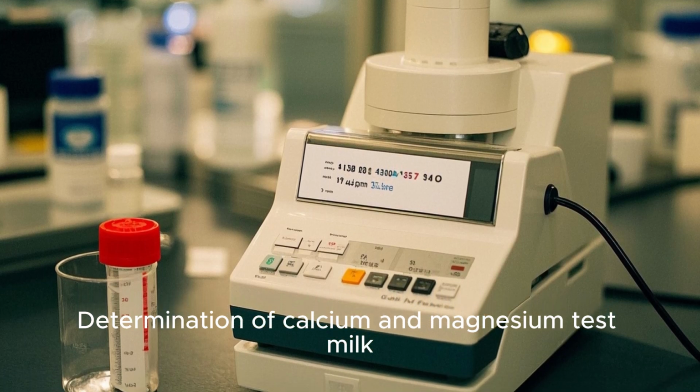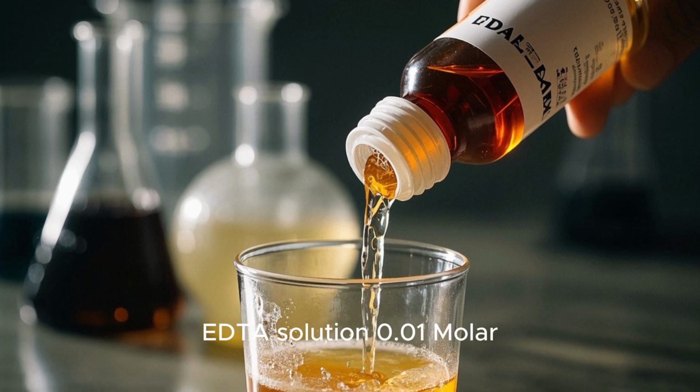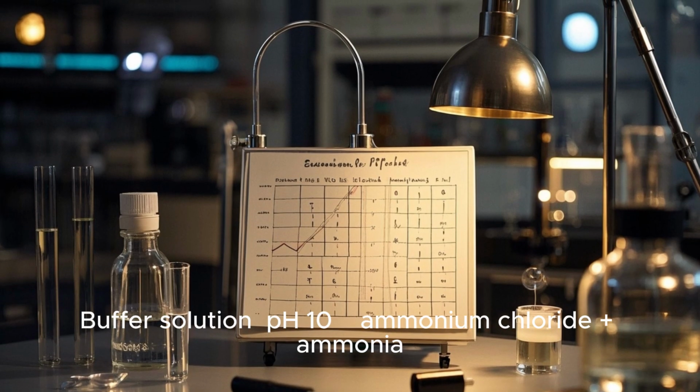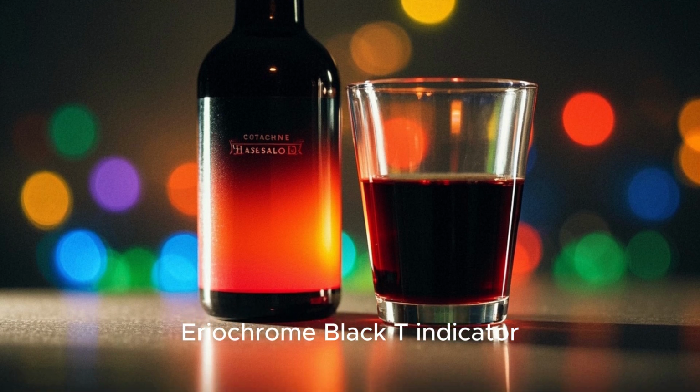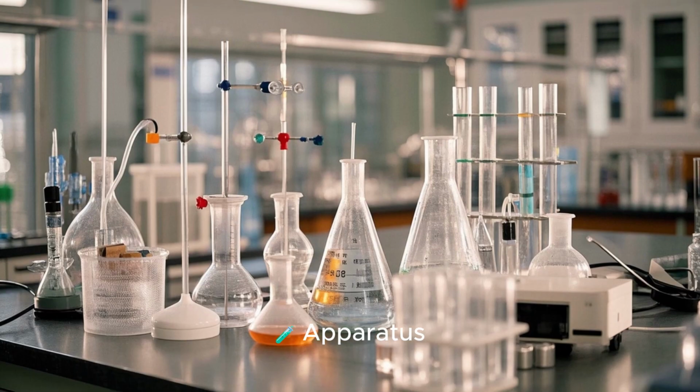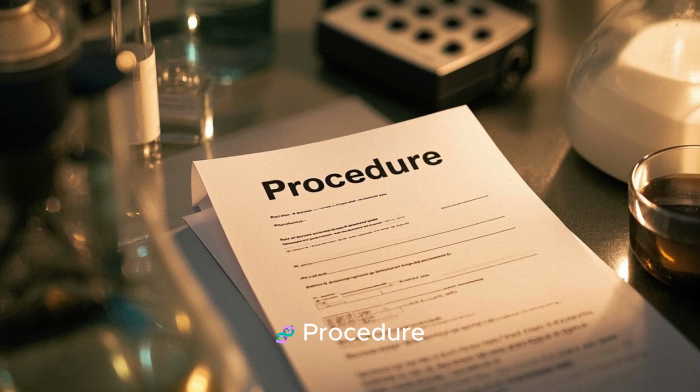Determination of calcium and magnesium in milk. Reagents: EDTA solution, 0.01 molar; buffer solution, ammonium chloride plus ammonia; Eriochrome Black T indicator; distilled water; milk sample. Apparatus: burette, pipette, conical flask, volumetric flask, beaker. Procedure.